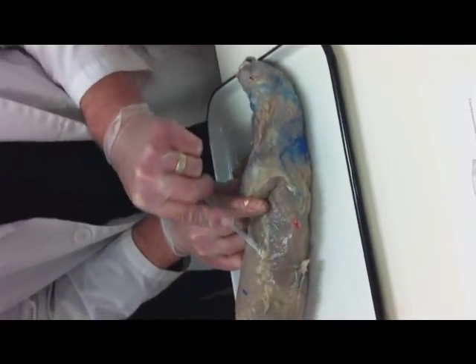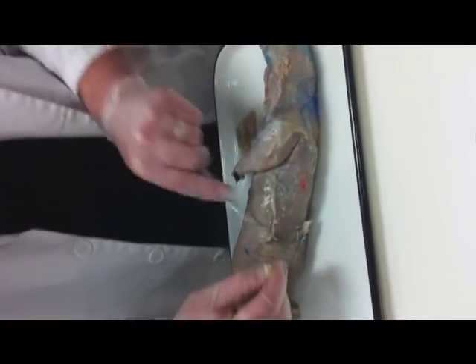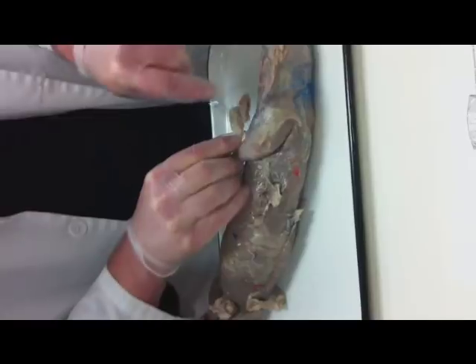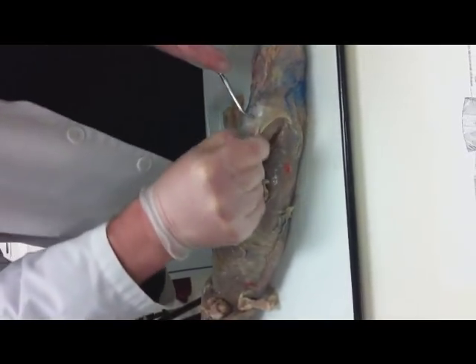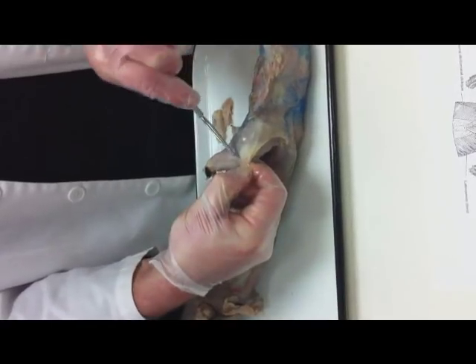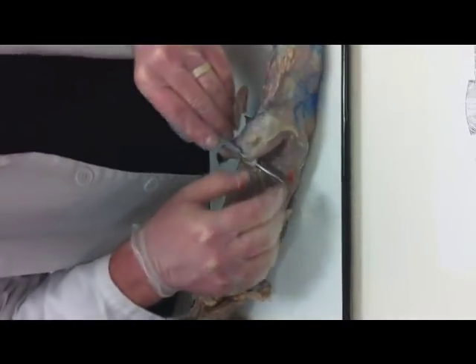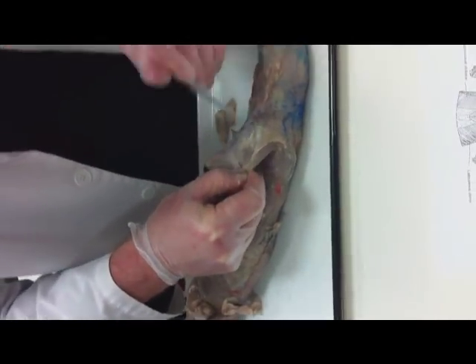To sit there and go, that's not going to do you anything. You've got to get under it and lift it and get rid of it. So don't be just pawing away. You're going to be there a very long time. So as I pull that up, see, there's the layer of fat there. And as I pull that away, then I begin to expose the muscles underneath.